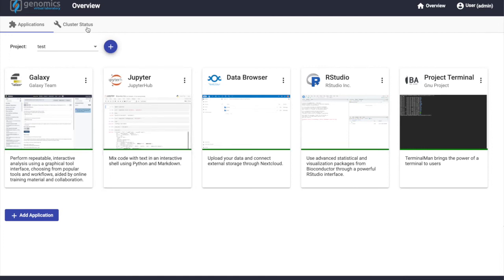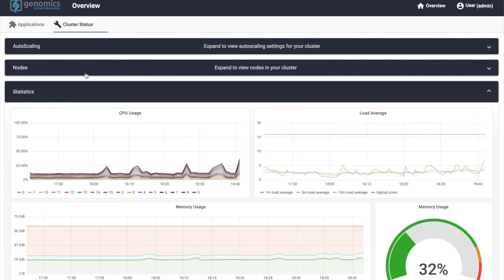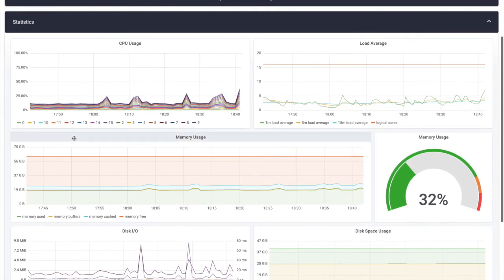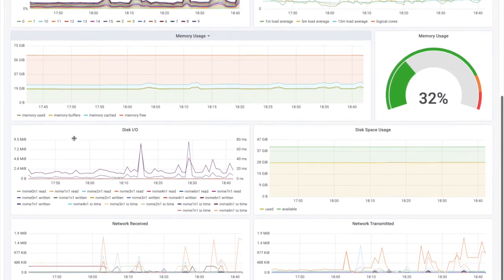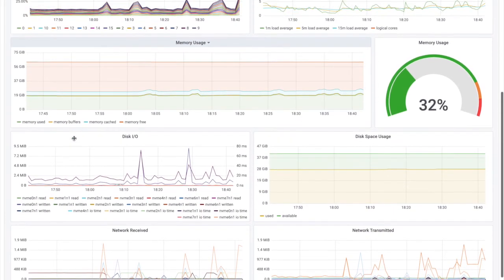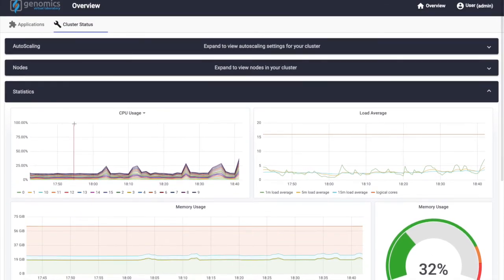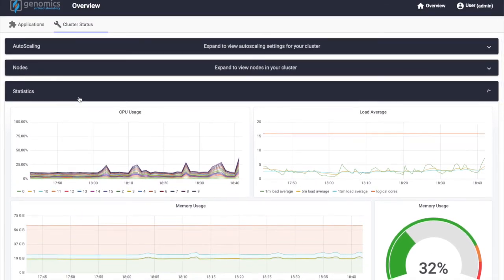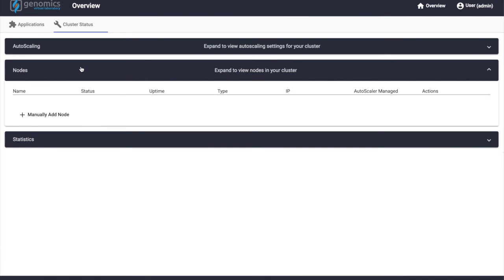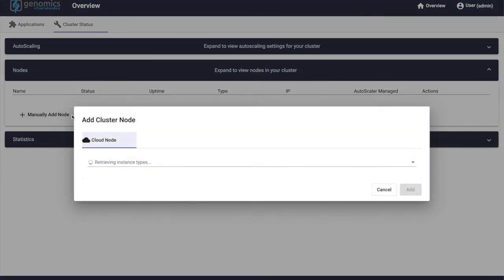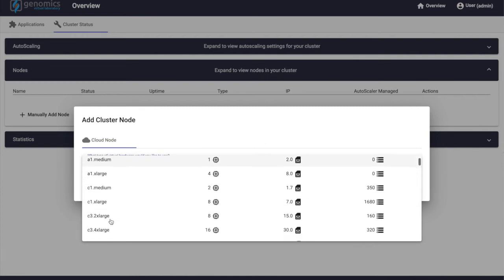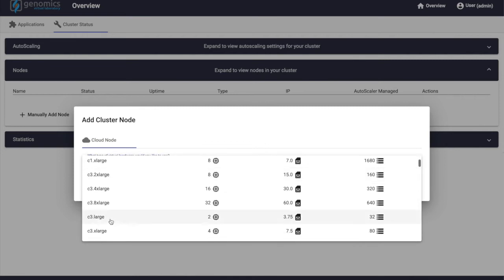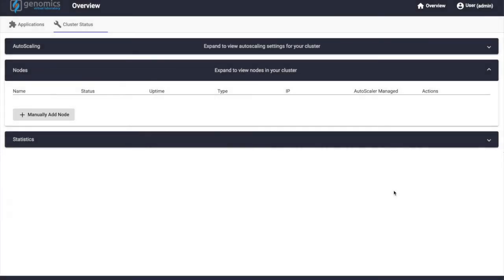In addition to the applications view, we also have the cluster status tab. This here provides us a graphical interface for the status of the current cluster or the hardware that the cluster currently runs on. Depending on the load on the system, we also have the option to expand the size of the cluster. We can manually add additional nodes to the cluster by clicking manually add node and selecting the type of virtual hardware we would like to use. By clicking add, additional nodes will be automatically provisioned that can be removed at any point in the future.